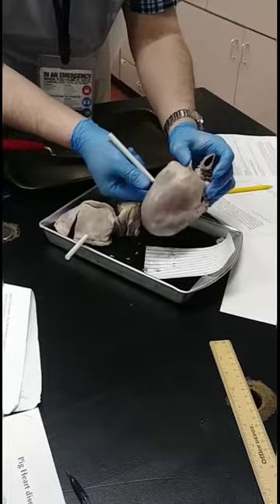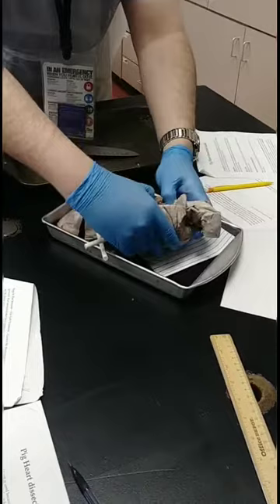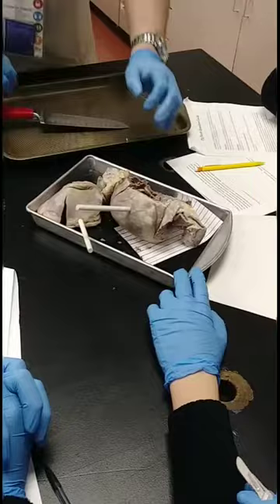the auricle, which covers the atrium and some of the pulmonary trunk. Okay? Like up here is the aorta complex. All right? So just open up a little more by using your scalpel. Don't worry about pinning to the wax. It's a little stiff because it's been in the refrigerator all day, so it's not going to stick to the wax all that well. Okay? Just be careful, guys. Make sense?